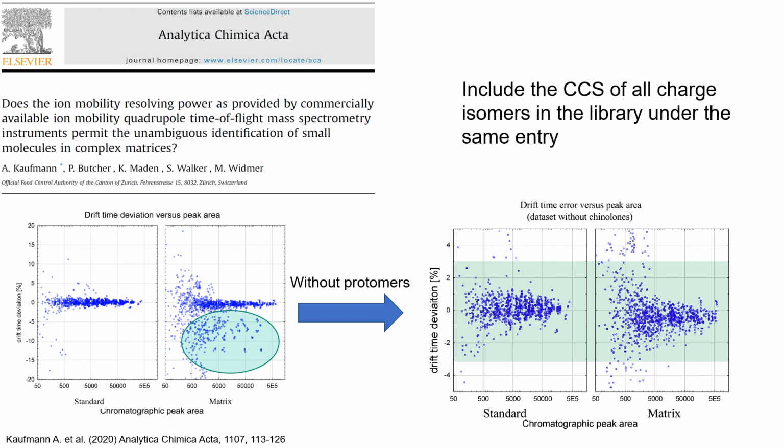If the sample, for example, contains an enormous peak, not eliminated by the sample preparation, and that perfectly coalesces with one of our analytes, it's an isomer with the same molecular formula or with a mass difference below 5 ppm, it has the same drift time, and maybe it also produces the same fragment, then there is very little to blame ion mobility, and I would call this bad luck instead.